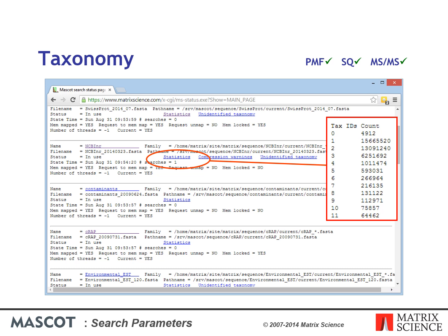There are 38 million entries, and 4,912 have no taxonomy. In other words, 99.99% of the entries have a taxonomy assigned. If you look at your stats file and see that, say, 10% of the entries have no taxonomy, that's 10% of the entries that are going to be missed whenever you do a search with taxonomy specified.